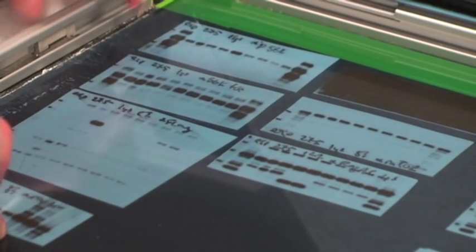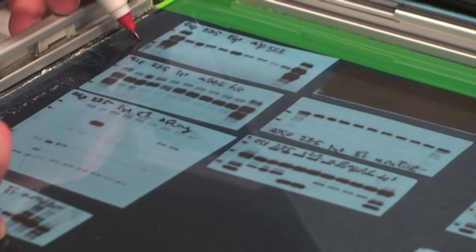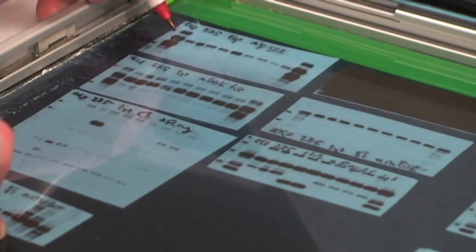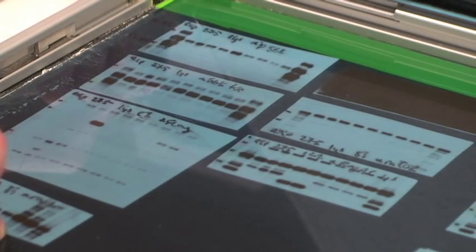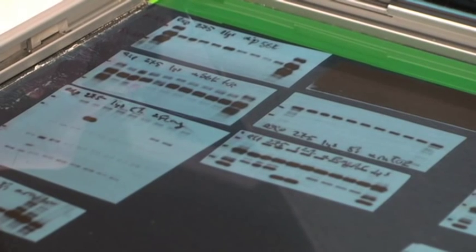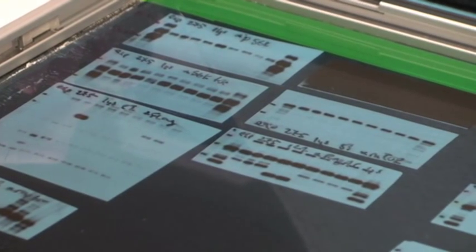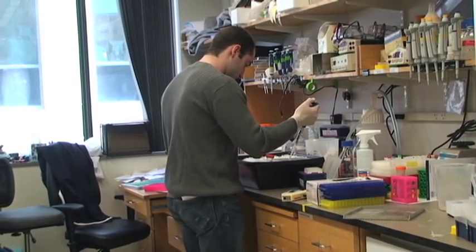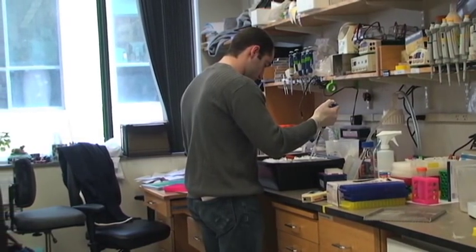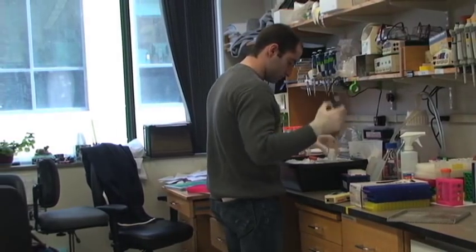So that's 50 kD, 70 kD. By laying the film on the blots, Larry can determine the size of his protein bands by comparing them to the ladder, and the relative intensity of the bands corresponds to the amount of protein in the sample. And that's the Western blot from beginning to end.